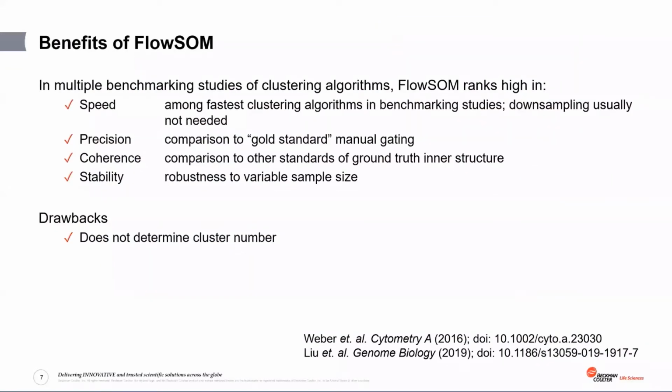In multiple benchmarking studies of clustering algorithms, FlowSOM has been shown to rank high in speed, precision, coherence, and stability. One potential drawback for some of FlowSOM is that it does not determine cluster number. However, it is well suited for many cytometry applications overall.